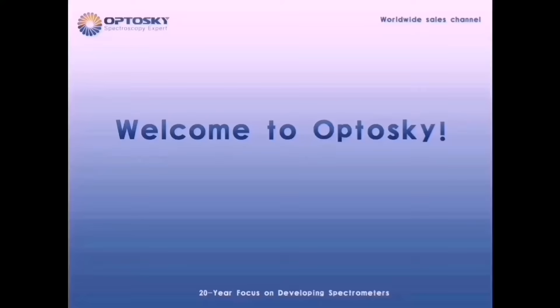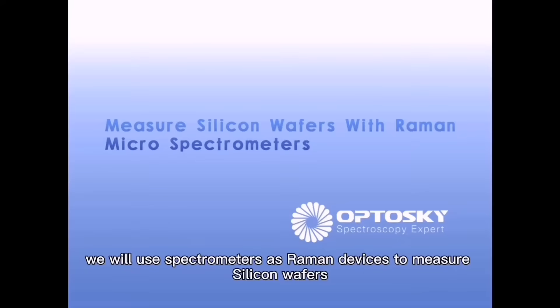Welcome to Optosky. Today we will use spectrometers as a Raman device to measure silicon wafers.